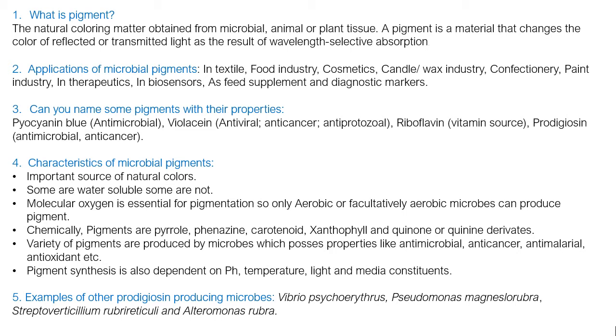Then characteristics of microbial pigments. Okay, so microbial pigments are important source of natural colors. Okay, so this is very important that these pigments are not synthetic, they are natural source, so they don't have some negative effects on environment or humans. Okay, so some are water soluble and some are not.